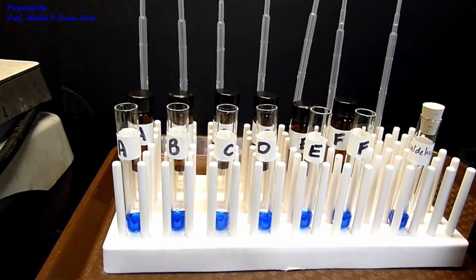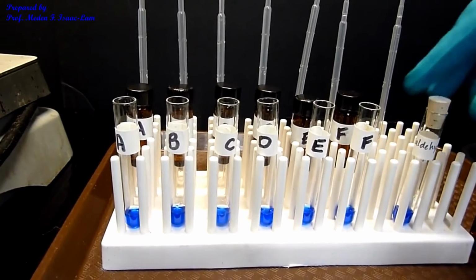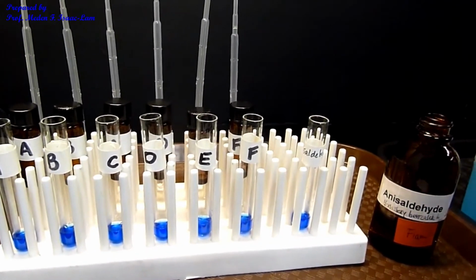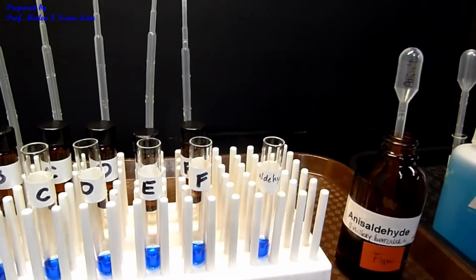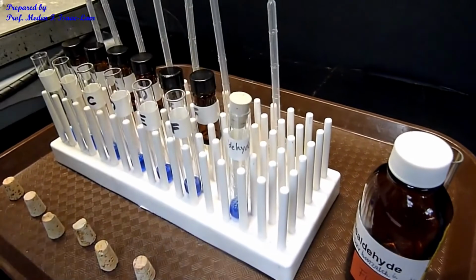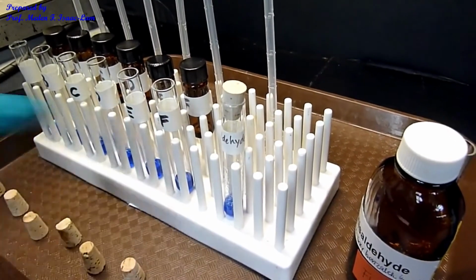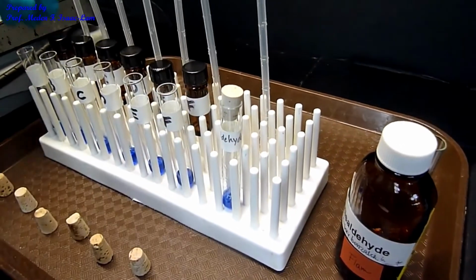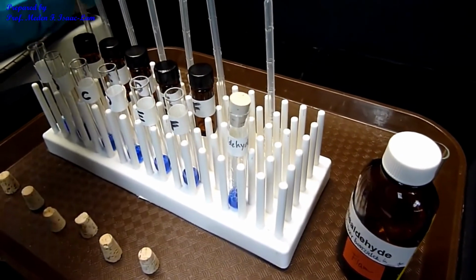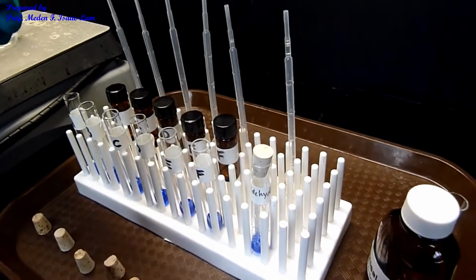I'm going to add 3 drops in here. I just mixed it up, I just vortexed it, and then I'm going to do the same thing for A, B, C, D, F. So these are our samples, and I'm going to add 3 drops.